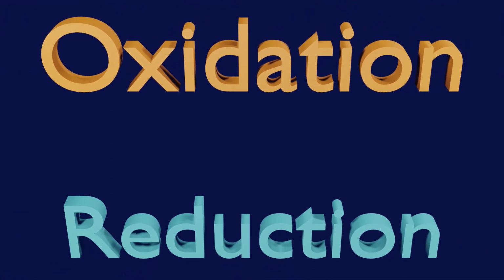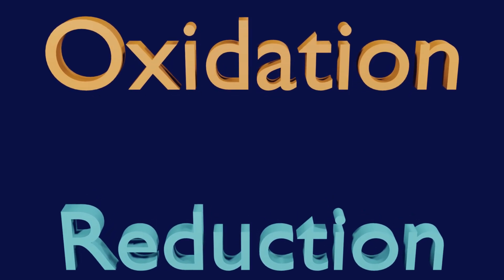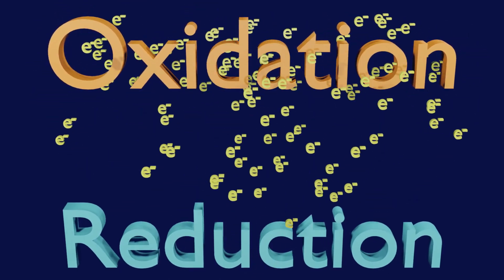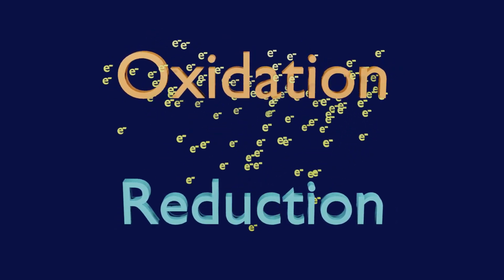The processes of losing and gaining electrons are called oxidation and reduction. Both are happening here in this solution. We call a reaction that involves oxidation and reduction a redox reaction.